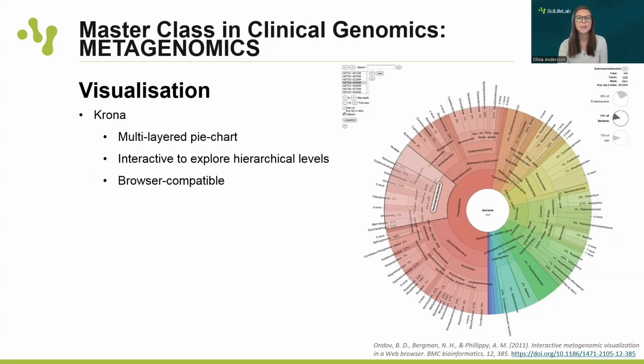And since they are so easy to use, as well as interpret, and provide a per sample view, they are well suited for clinical applications. And while Krona excels at this type of interactive visualization, further analysis and a more in-depth exploration of the results is often required, and this requires additional tools.